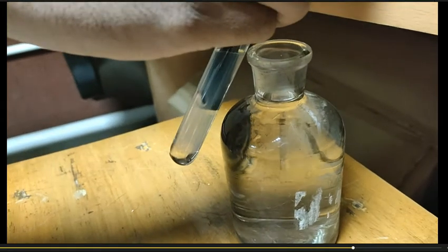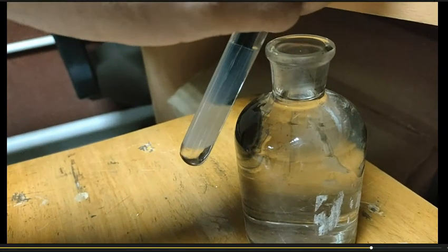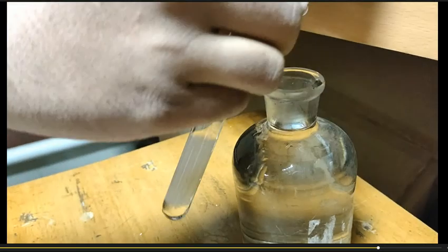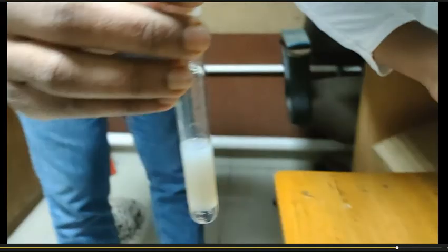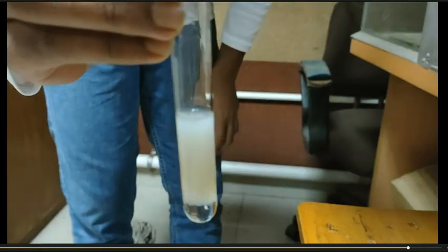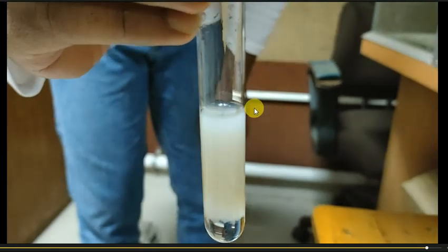We can see that the PPT reappears, and certainly this is indicative of the presence of zinc ion. That's all for the group 3 cations.